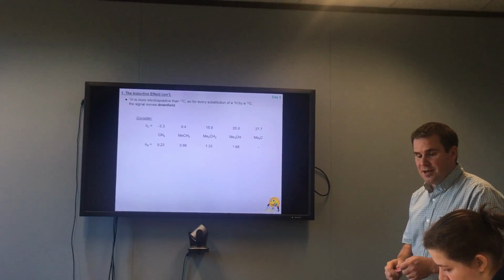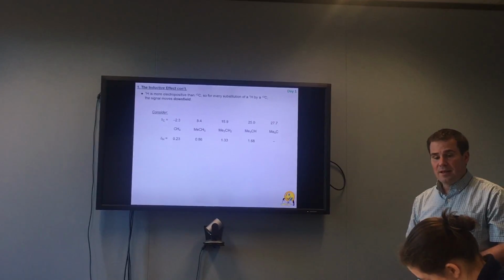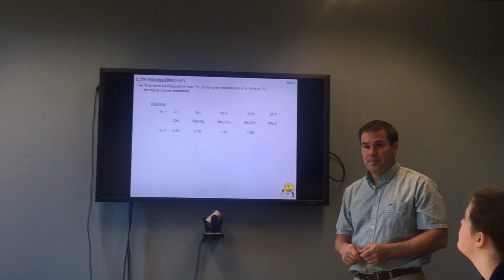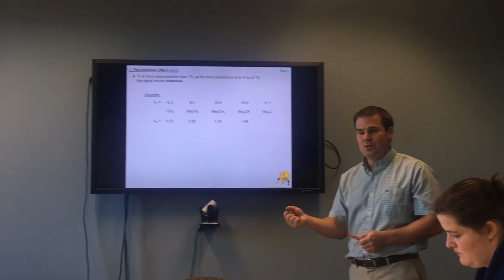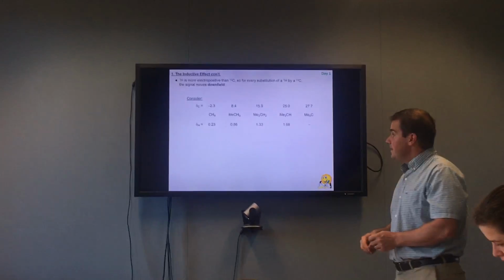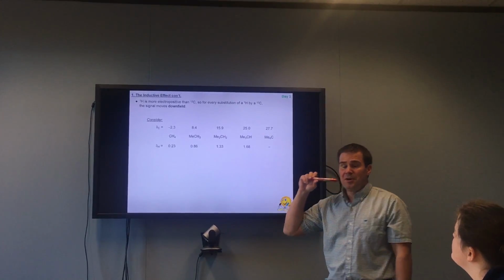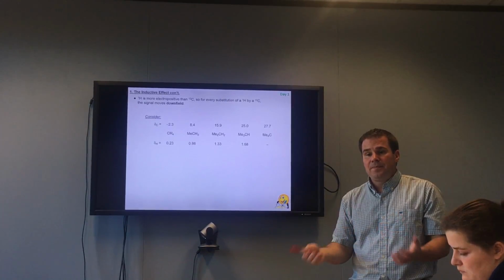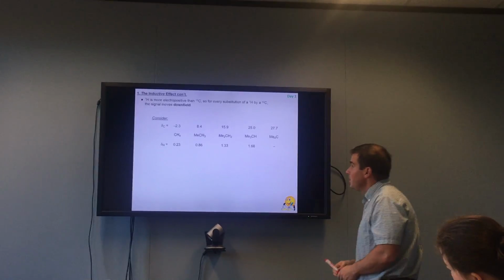So that means that every time you take away a proton and you replace it with a carbon atom, the signal is going to move downfield. Okay, because you're pulling more electron density away by adding this more electronegative element. And that gets us to a really, really useful series. Actually, this is super useful to remember in terms of predicting chemical shift numbers. These kinds of trends are really important.